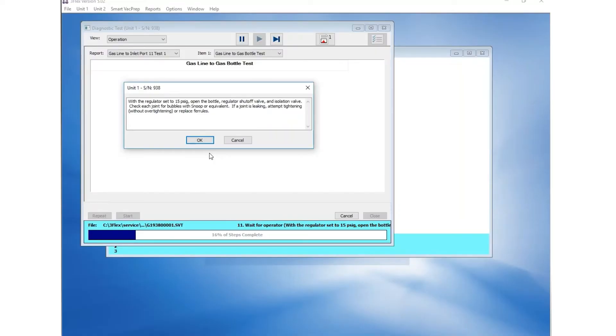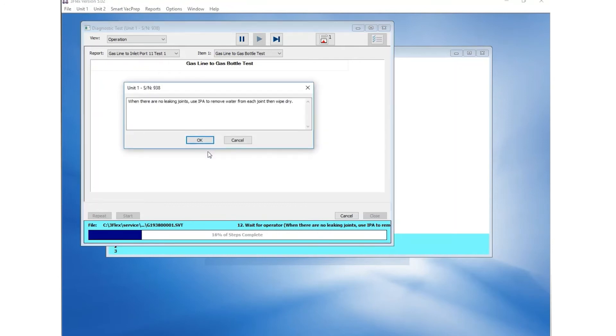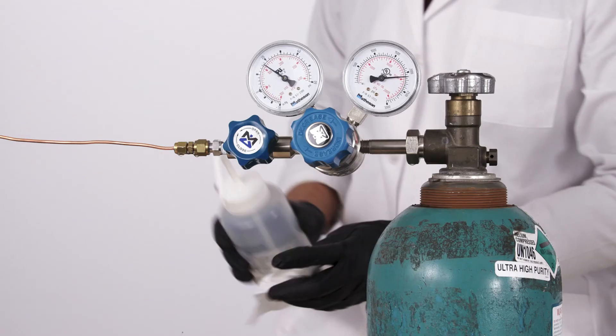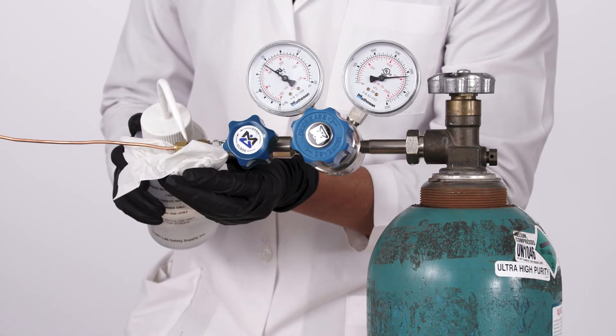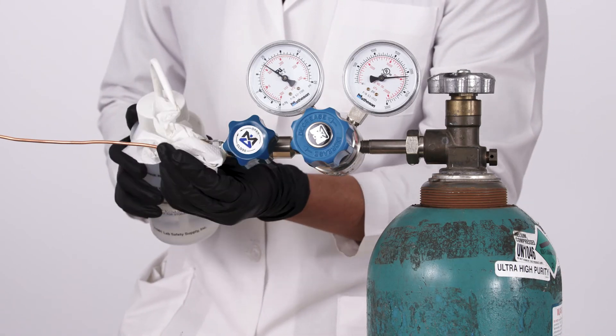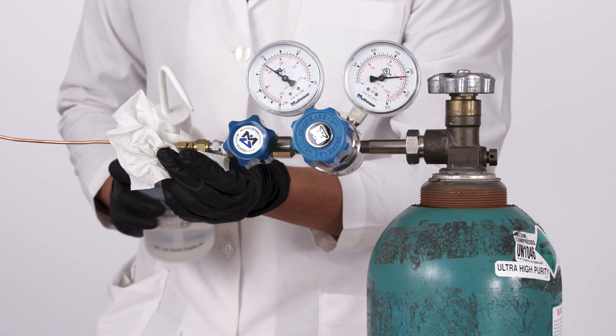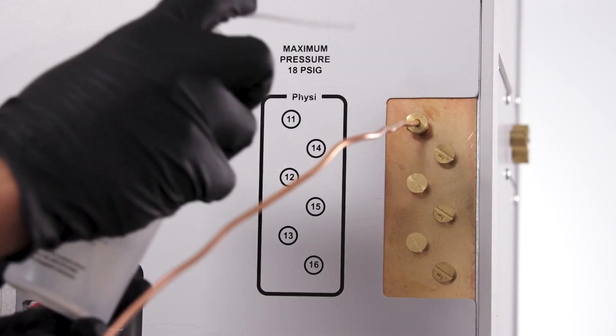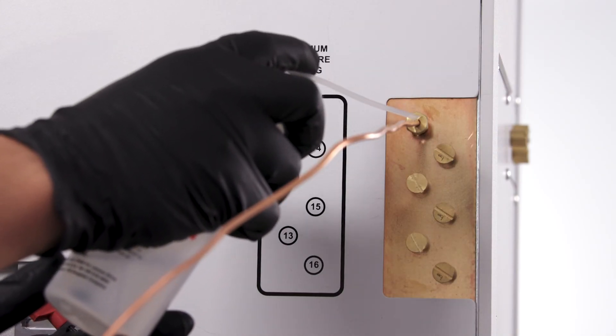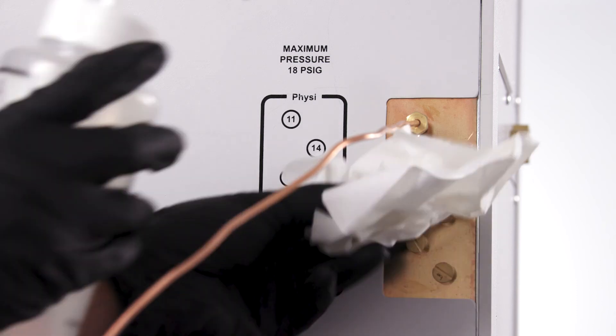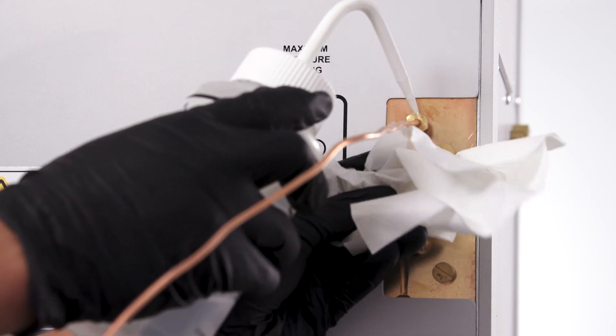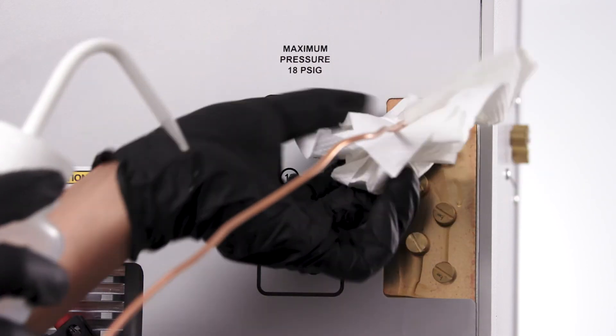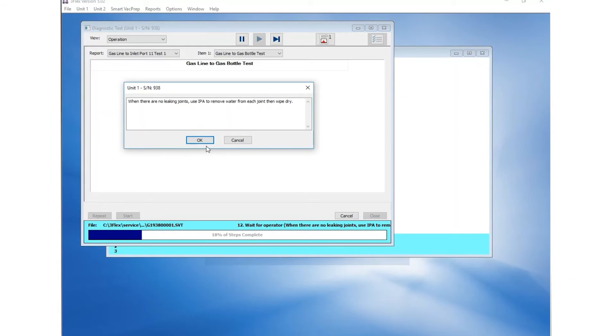Click OK on the third prompt if there are no leaks. You are prompted to perform a manual rinse of the connections with IPA and wiping the connections dry. Click OK once this is completed.